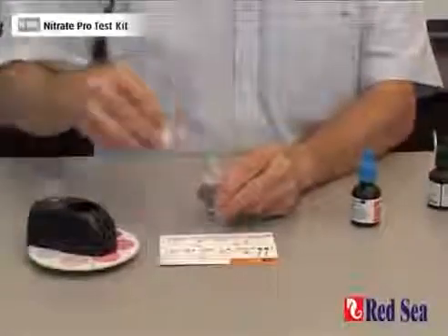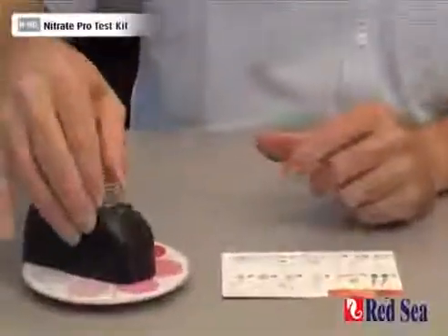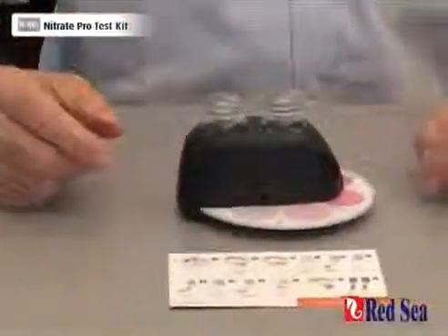When that's done, remove the lid and place the vial into the comparator. We are now going to wait for nine minutes for the reaction to develop.